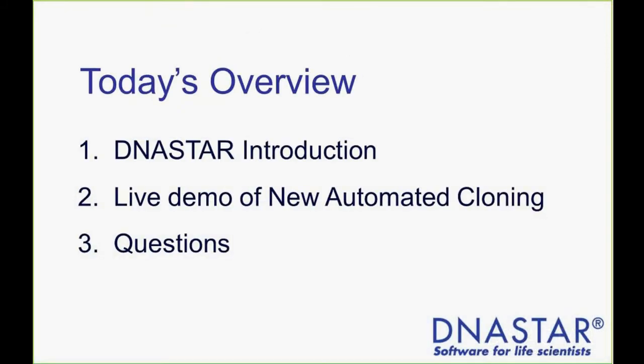The format of today's overview will essentially consist of three different items. There's going to be a brief DNASTAR introduction. We'll actually do a live demo of the new automated cloning interface in our SeqBuilder application, and then a question and answer period at the end. As Sharon mentioned, feel free to submit any questions to Sharon directly via that live chat, and we can answer them accordingly.